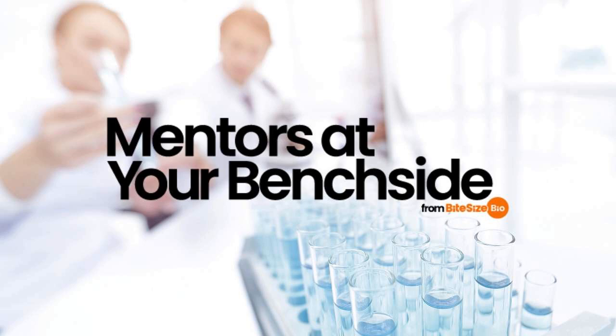High-quality nuclei extraction is pivotal for these applications, as the purity and integrity of nuclei directly influence the accuracy and depth of the sequencing data. In this episode, I'll provide practical tips to prepare high-quality nuclei extracts and tailor your extraction protocol to your sample. Explain methods to count nuclei and assess their quality, including the pros and cons, and demonstrate how automated nuclei counting can improve your workflow.